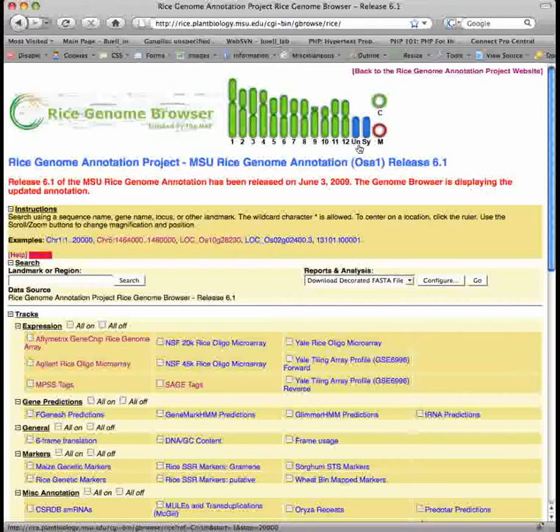The unanchored pseudomolecule is based on BACs and PACs sequenced by the IRGSP that we were unable to anchor to one of the 12 chromosomes. These BACs and PACs have been stitched together head to tail to form a single pseudomolecule. The Syngenta pseudomolecule contains Syngenta Nipponbare sequences that we were unable to align with the 12 chromosomes, and represents novel sequences from Nipponbare.